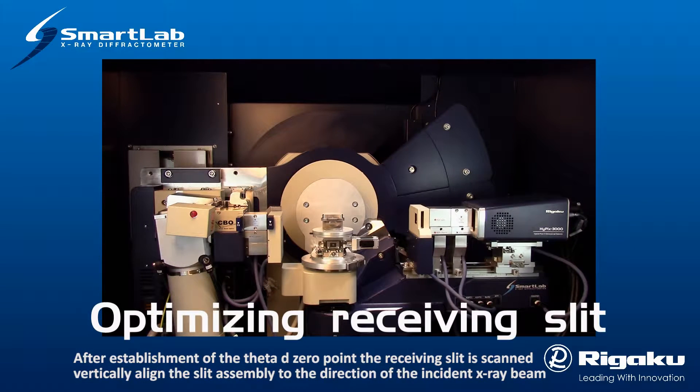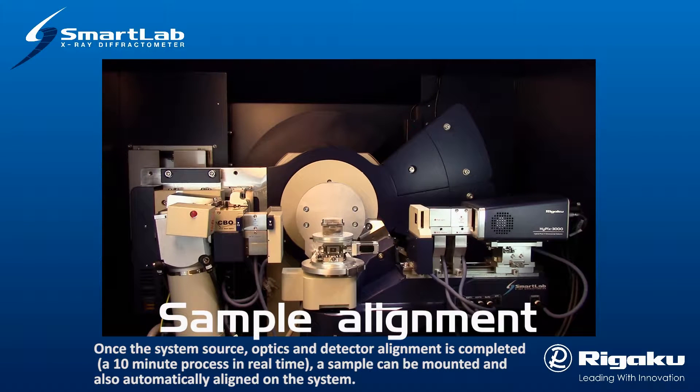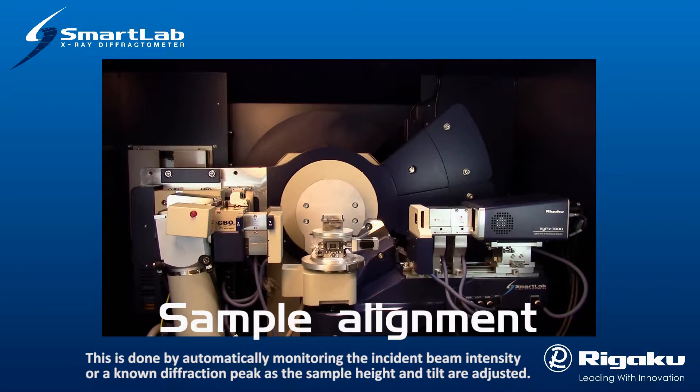After establishment of the theta-D zero point, the receiving slit is scanned vertically to align the slit assembly to the direction of the incident X-ray beam. Once the system's source, optics, and detector alignment is completed—a 10-minute process in real time—a sample can be mounted and also automatically aligned on the system. This is done by automatically monitoring the incident beam intensity or a known diffraction peak as the sample height and tilt are adjusted.